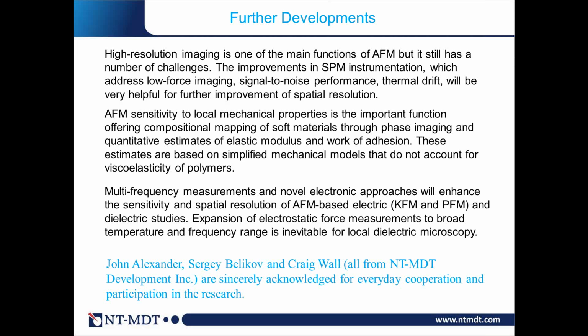Yeah, I understand, but peak force is nothing different than the pulse force mode, which is kind of improved electronics, which gives some better capabilities of doing the measurements.